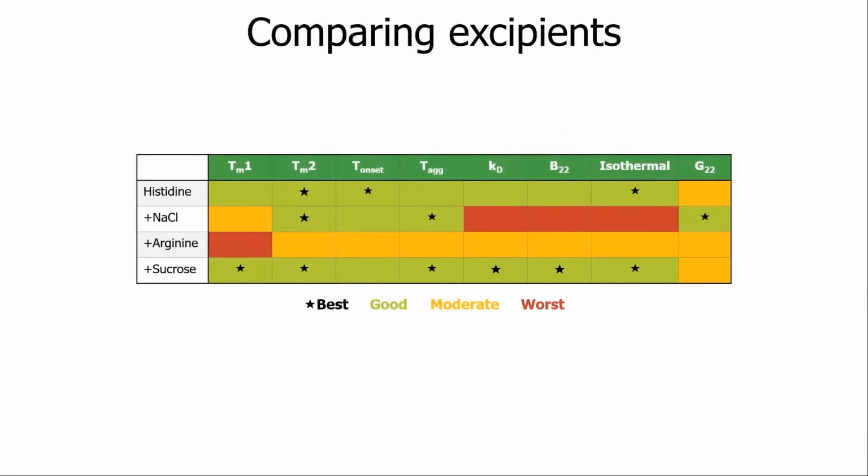Okay, so if we were doing this for a living, what would we do next? What choices would we make? Well, the first question is, what concentration do we really care about? If this is an antibody critical reagent destined for an ELISA, you may be more interested in lower concentration behaviors. If it's a drug substance headed for an injectable formulation, you would put more stock into data gathered at higher concentrations.